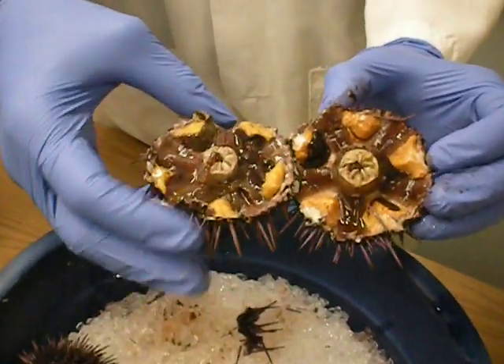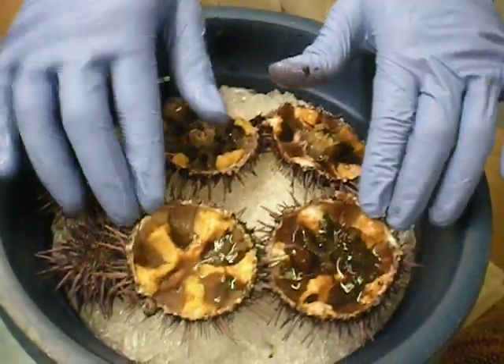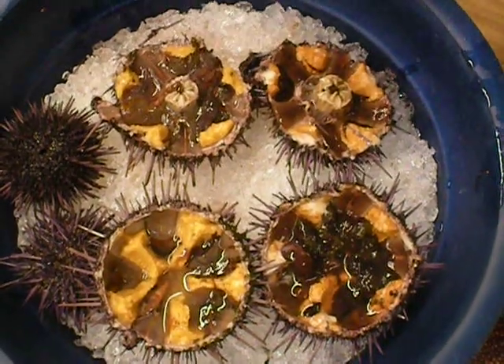If you have a microscope, you could probably see eggs within the gonads. Cool. Alright, if you guys are done with whatever else you're doing, you could come and try to cut open the sea urchin, because they're going to throw these all away.